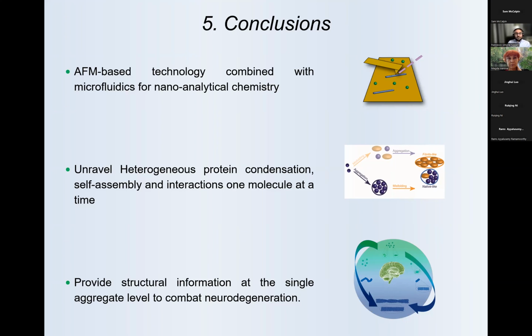But of course, it would not always be ideal to measure something on a surface. Cryo-EM is great for that. The only problem with cryo-EM is that you often need to average multiple aggregates to get structural determination.